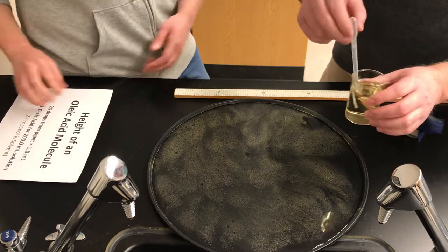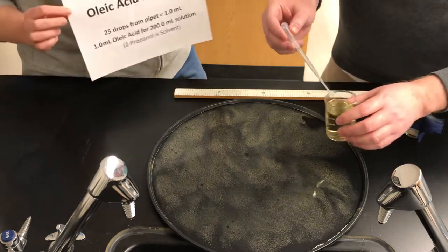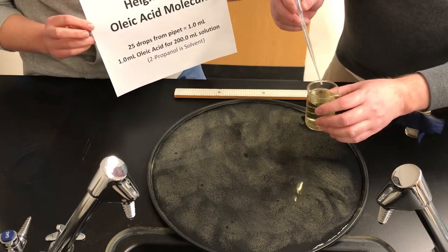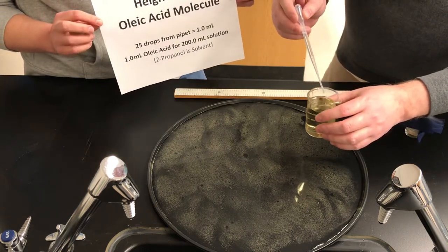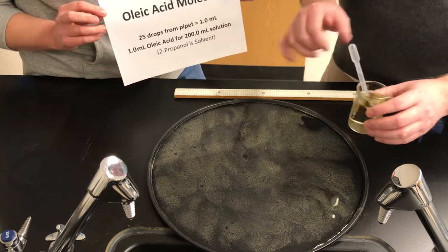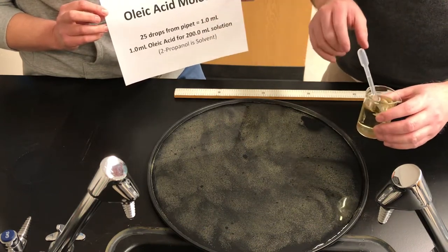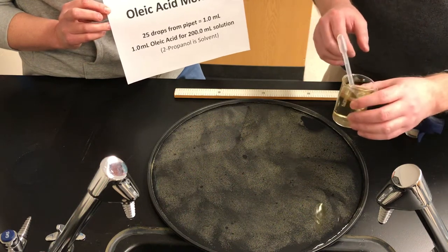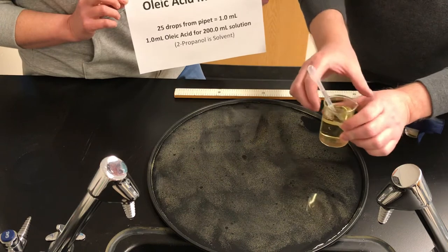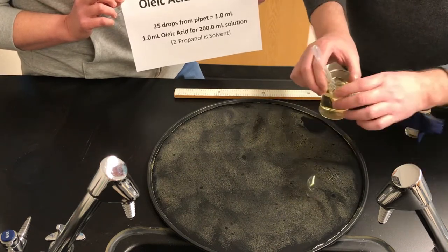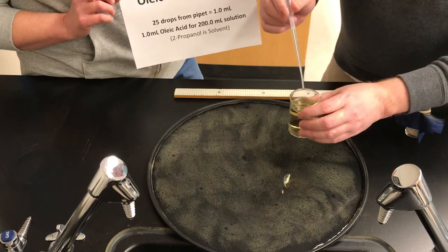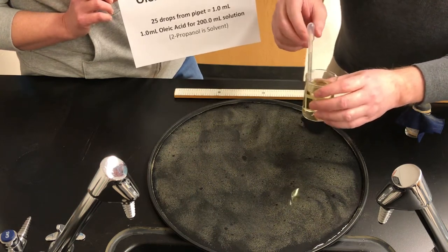Now, on the original sheet, it told you that we're using a plastic pipette that has, we measured that 25 drops from this pipette gives us one milliliter of solution. So you're going to want to make sure you've written down both of those pieces of information. The solution is, again, one part or one milliliter oleic acid for every 200 milliliters of solution. And also that there's 25 drops from this pipette will give you one milliliter.